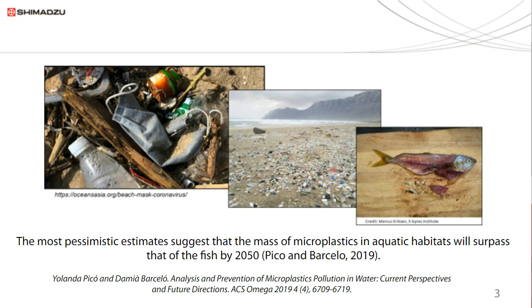For example, when somebody asks me how do I analyze disinfection byproducts, that's relatively easy. We know we need to measure the concentration. We normally use a GCMS, and that's it. We have the concentration, question answered. But in the case of microplastics, there are many questions that we can ask about them. What's the size? What's the number? What's the main ingredient, the composition?